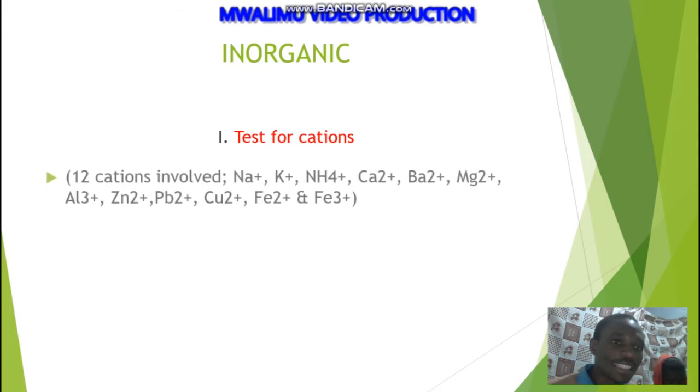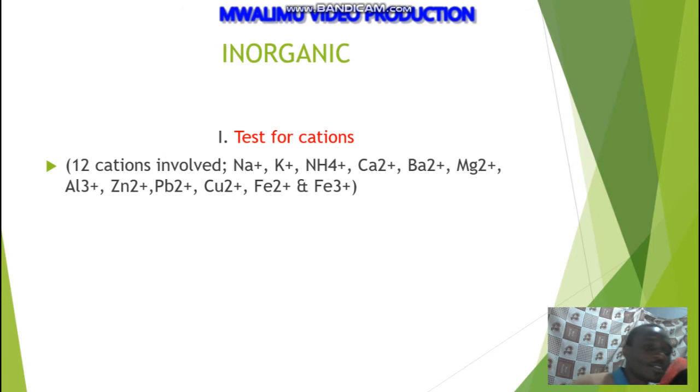Now, in the inorganic testing, we have the test for cations, and there are 12 cations involved.